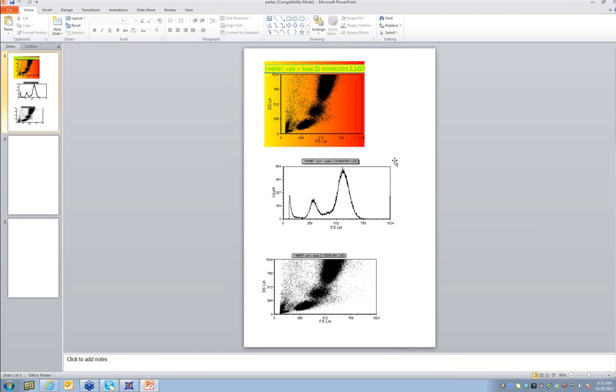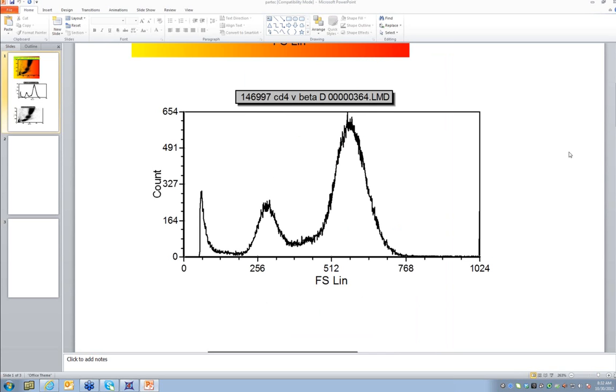Okay, so you can see that it's come up here, and even if I zoom the resolution quite high, you can see that the fonts and everything like that come up in very, very high resolution and are sent out in good quality. Again, those are some of the little details that we take care of to make sure that you have very, very good reporting capabilities from FCS Express.